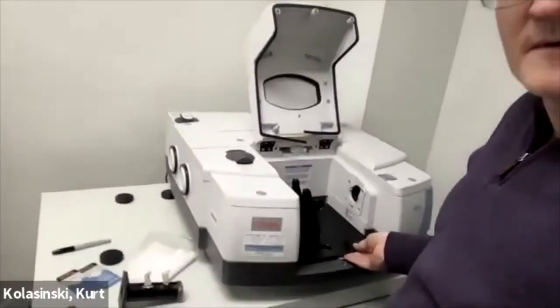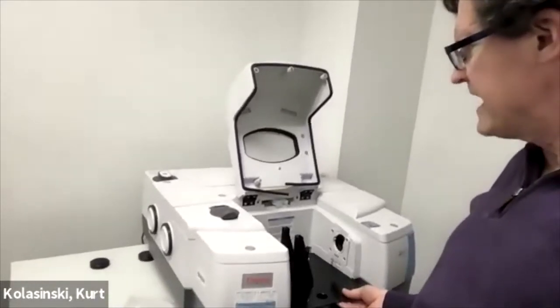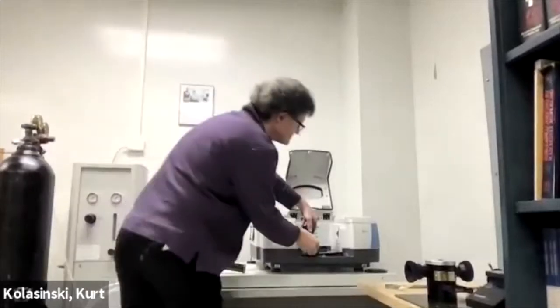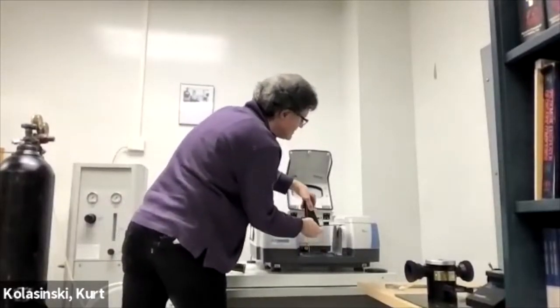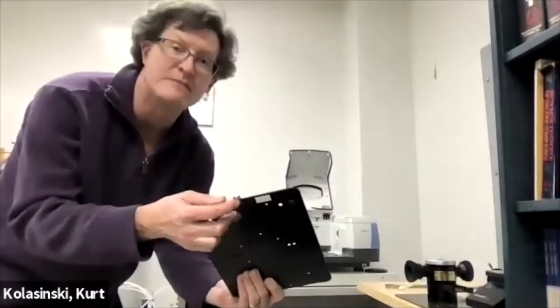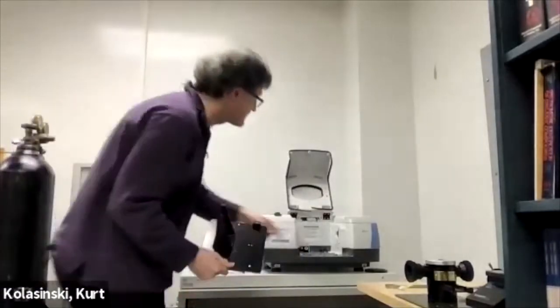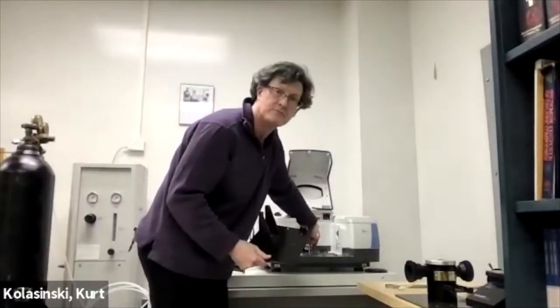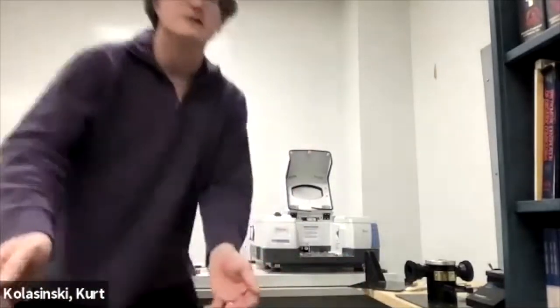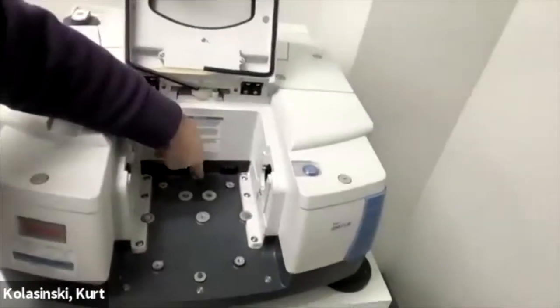The transmission cell, right? Here we go. They just lift out, right? Okay, so let me put this to the side here, right? The cells just lift out. Boom. Lift out of there. Be careful to lift those out gently like that. There's an alignment hole at the front, an alignment hole at the back. There are two posts that will meet there and there. Here, let me show you those. Two posts here and a post there.